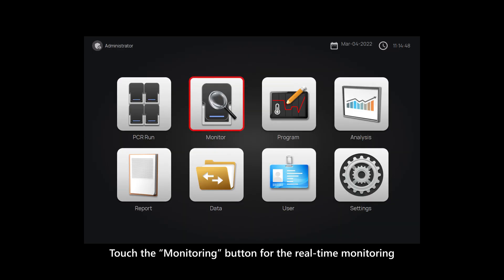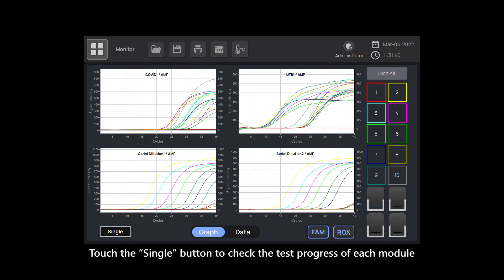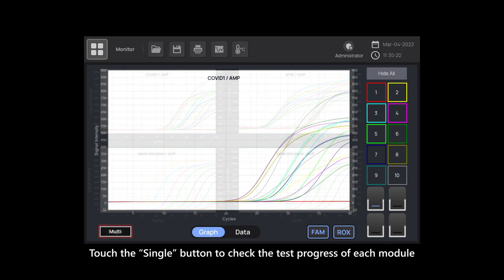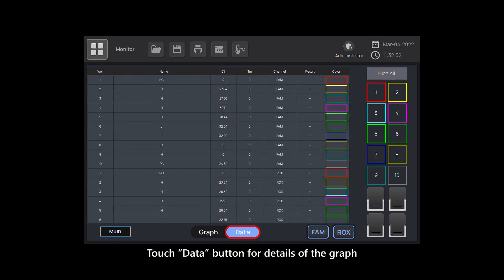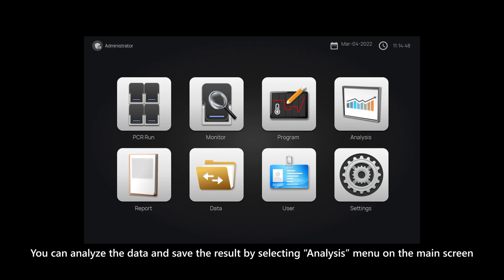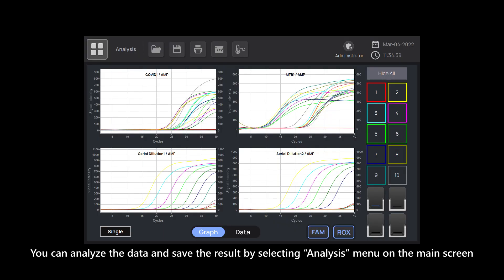Touch the monitoring button for real-time monitoring. Touch the single button to check the test progress of each module. Touch the data button for details of the graph. You can analyze the data and save the result by selecting the analysis menu on the main screen.